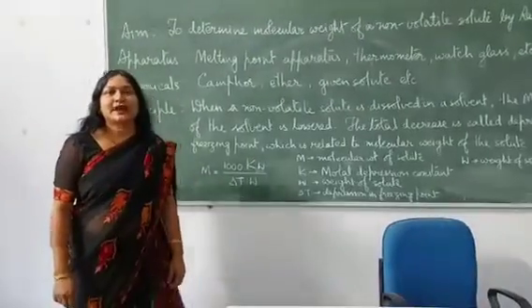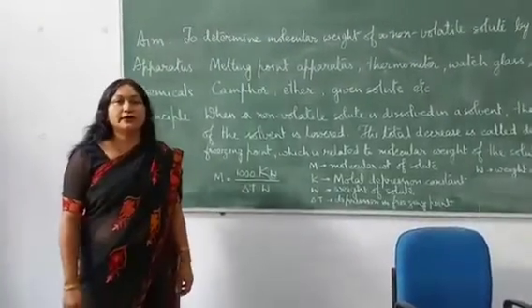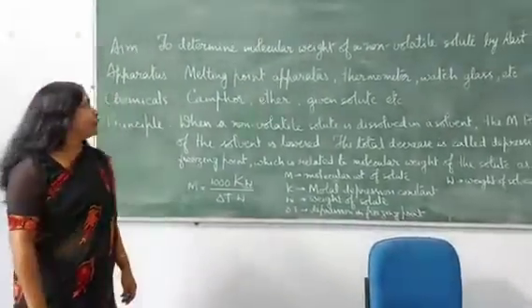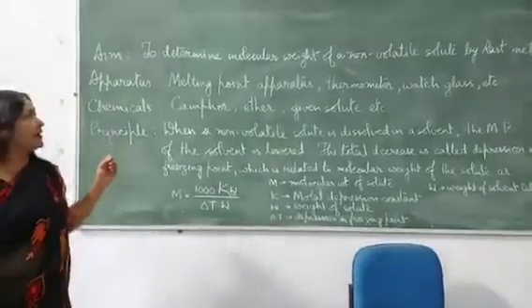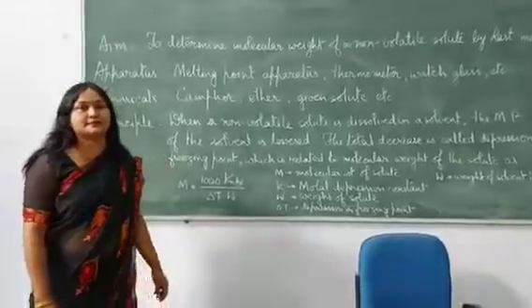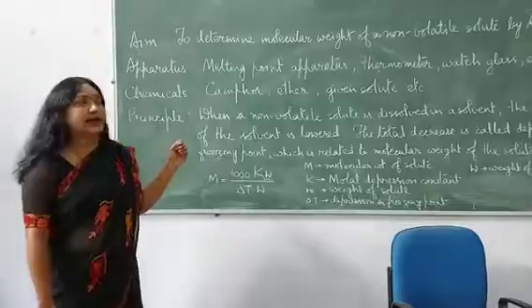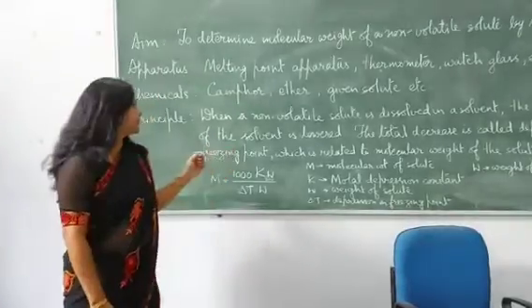Hello students, our today's experiment is to determine the molecular weight of a non-volatile solute by Rast method. For this, the apparatus required are melting point apparatus, thermometer, watch glass, etc. And the chemicals required are camphor, ether and the given unknown solute.